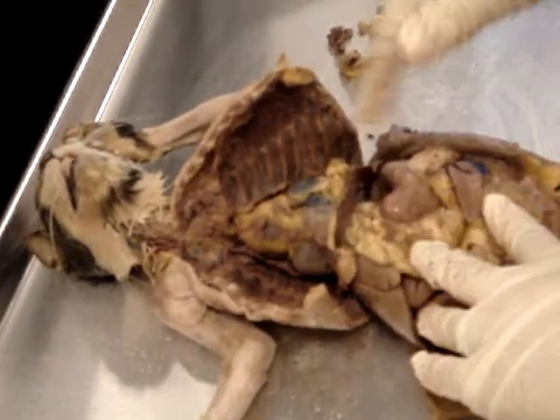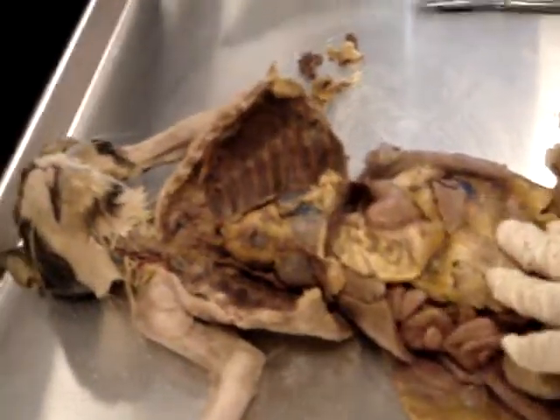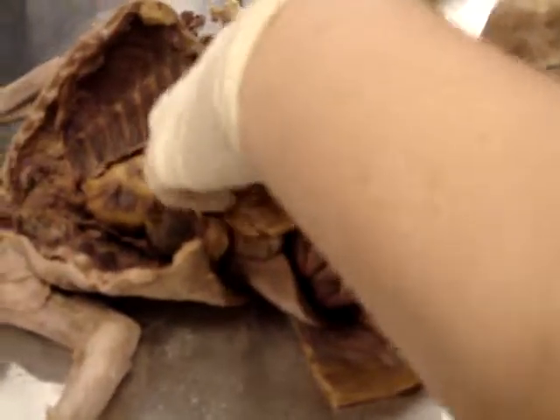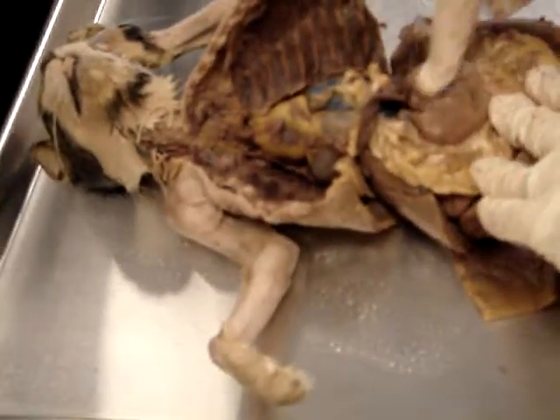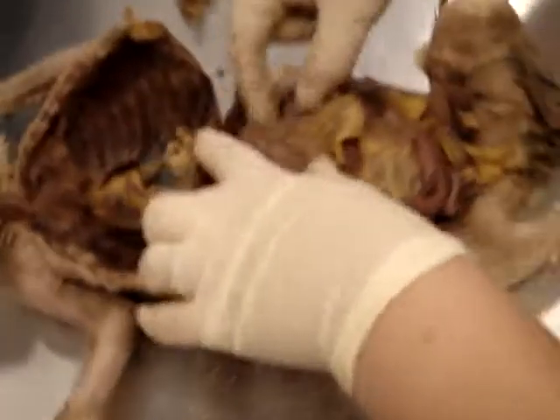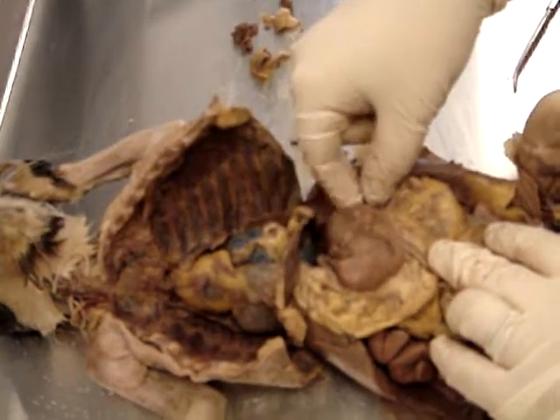So you can't really see it yet, but it's under there and it goes up behind all the organs in the thorax, okay? Our stomach has several parts that are worth knowing. So the fundus: the stomach is kind of like a J shape. It's real fat on the top. So you see this piece that's curved on the top here of the stomach? That's called the fundus.